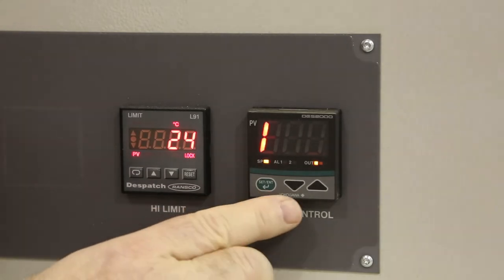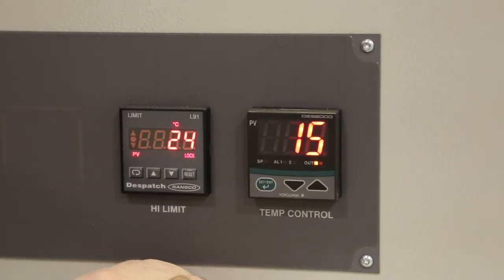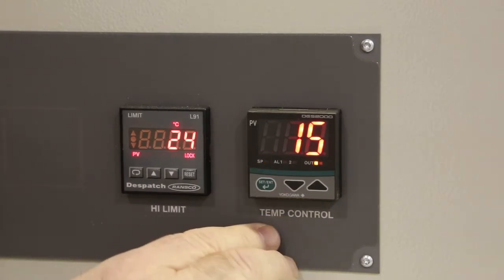Cycle the green button twice to get to I for integral value. The integral value should be set to 15. Any adjustments can be made using the up and down arrows.